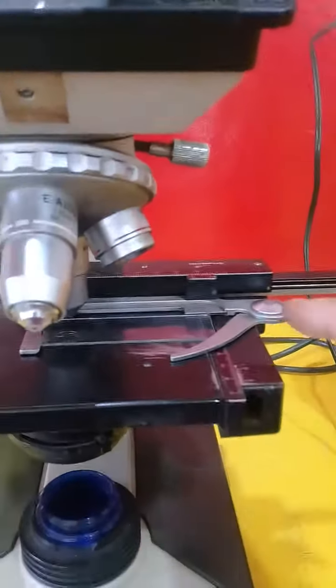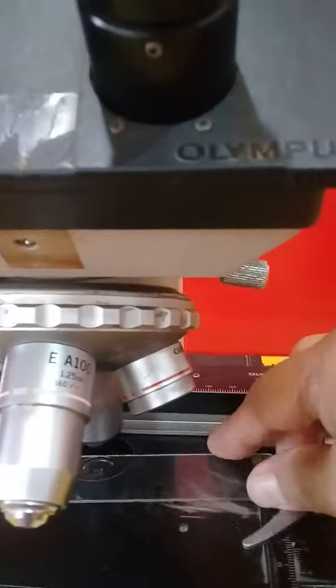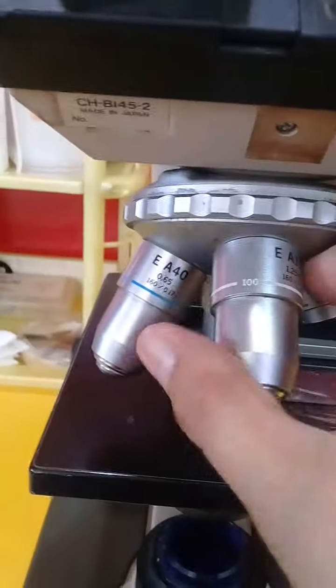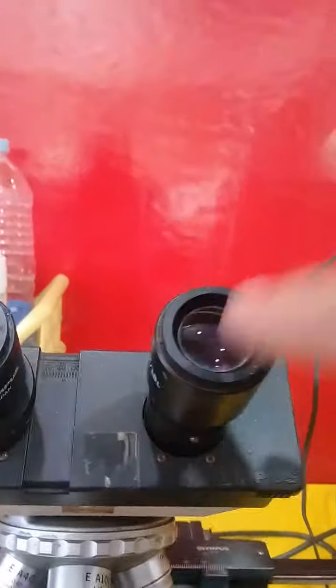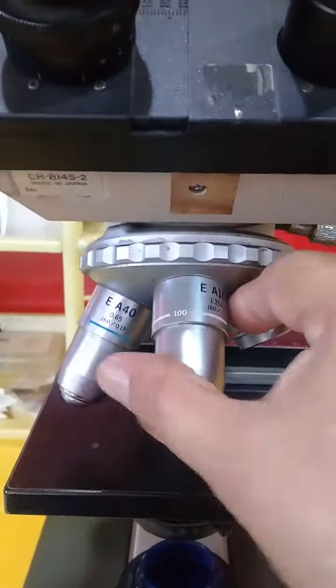This is the stage clip, and this is the stage, and this is the slides where you put the specimen. You can look through from here to here. This is the high power.